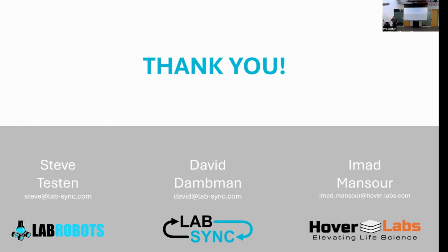How long does it take to build up a production line? That can vary a lot, especially with the lead time of buying the equipment. Generally when we're building at a work cell level, with one or more robotic arms and let's say a dozen instruments, lead times could be up to 12 to 16 weeks just to get the equipment in-house.